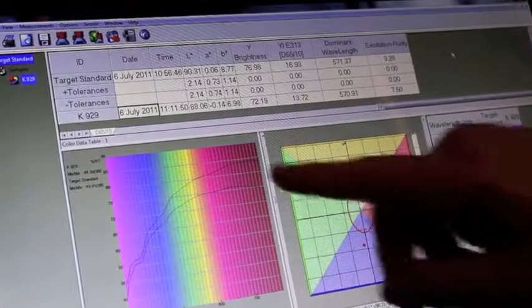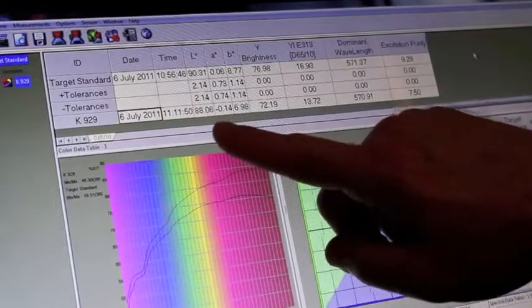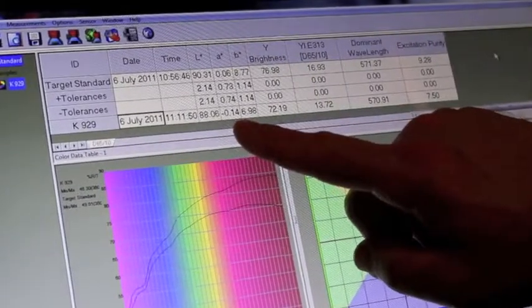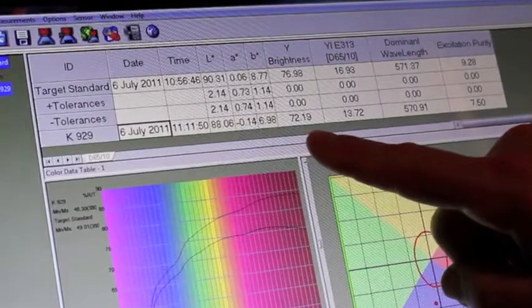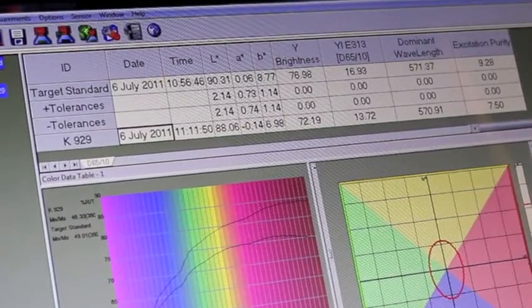And after taking a measurement, it shows the lightness, a slight greenness with our A value, the yellow value of nearly seven, and along with its brightness and yellowness index values.